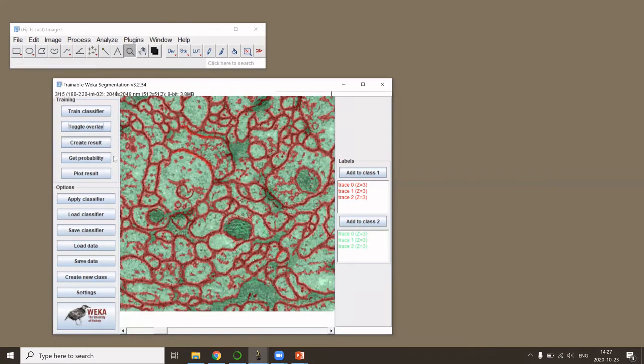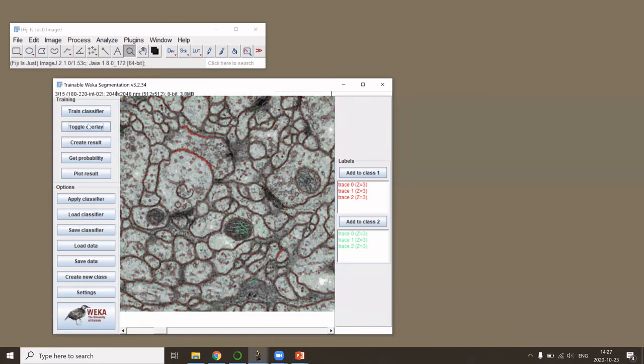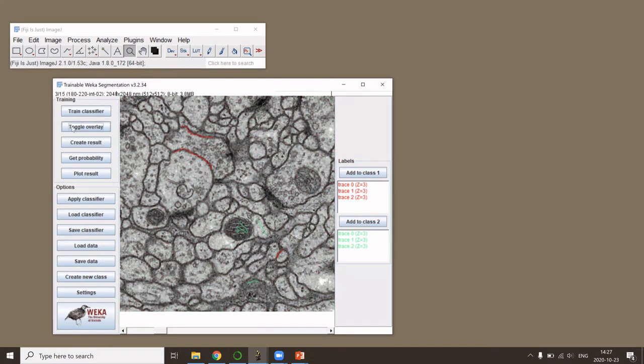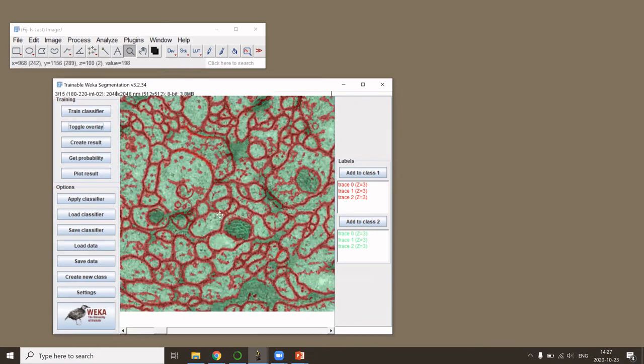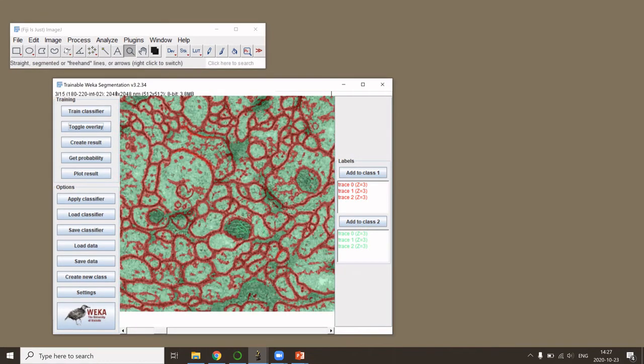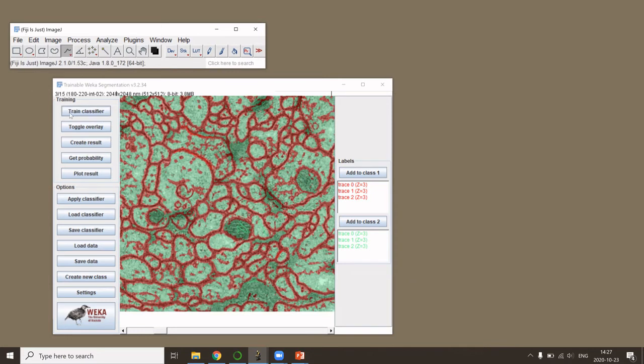If you say, well here actually you would like to correct, of course you could then add a few more annotations and retrain the classifier.